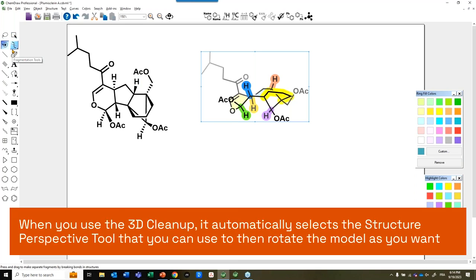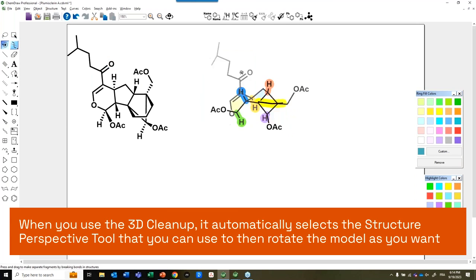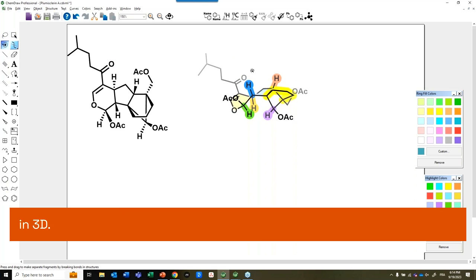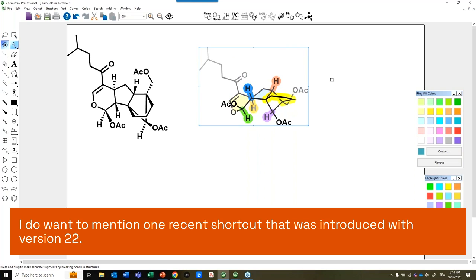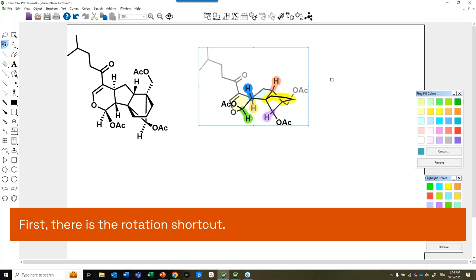When you use the 3D cleanup, it automatically selects the Structure Perspective Tool that you can use to then rotate the model as you want in 3D. I do want to mention one recent shortcut that was introduced with version 22. First, there's the rotation shortcut.